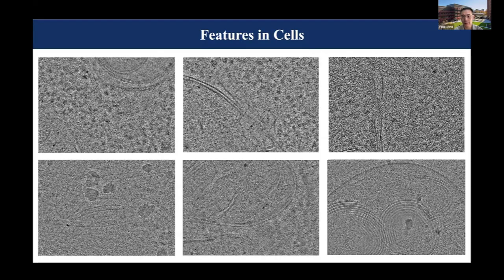This is the very first data set that we collected on a single particle milled cell. We don't know how this will go. During data collection we were saying, if this is the first time we do this and we get a resolution in the final reconstruction better than 10 angstrom, we can call this a successful experiment. But it turns out the results are way better than we imagined.